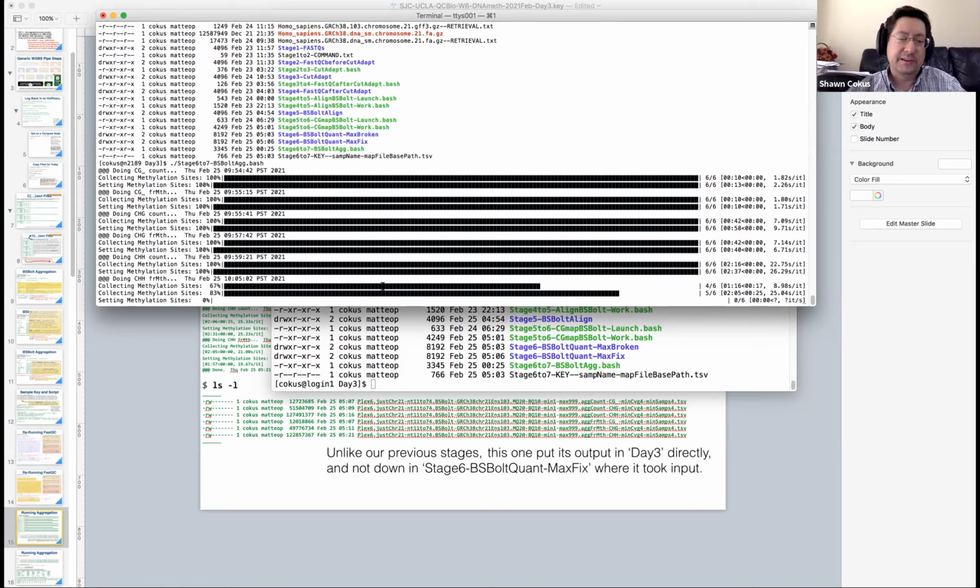Oh, I thought it was on the second stage. That's a side effect of the machine typing the A's, causing me to have 2 progress bar lines for only the first stage. Okay, so now we're starting the second stage of the last round. It's still like a minute estimate or something. All right, patience.